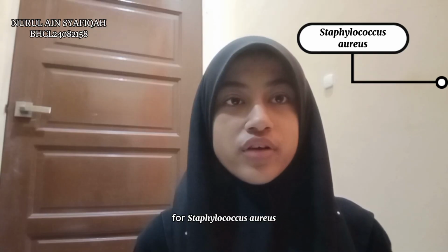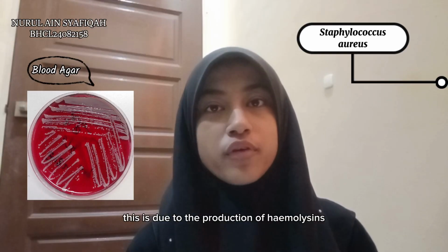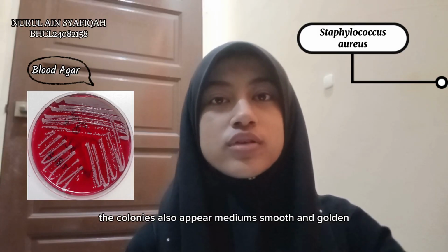For Staphylococcus aureus, the blood agar will show beta hemolysis with a clear zone around the colonies. This is due to the production of hemolysins that completely lyse the red blood cells. The colonies also appear medium, smooth and golden.